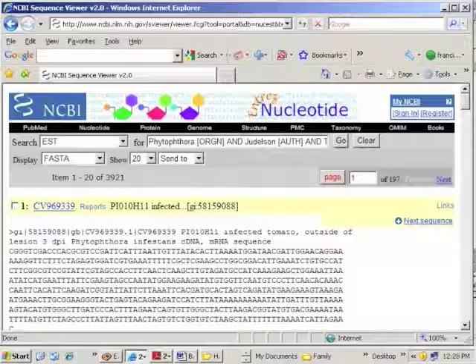So I've selected that here and then saved it, and what I get is a set of sequences that fits my Boolean search string. And so in this example, I'm giving you another Boolean search string. In this case, it's for Phytophthora as the organism. I'm using Howard Judelson as an authority. And over here, I also add tomato. Okay? So the reason for doing this is that this set of ESTs, which is housed in the database, comes from a tomato variety, Ohio 8245, that's infected by Phytophthora.